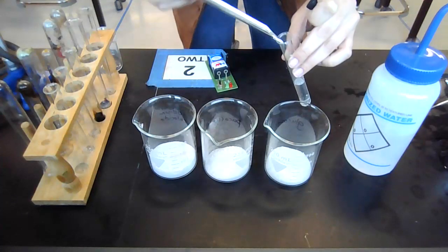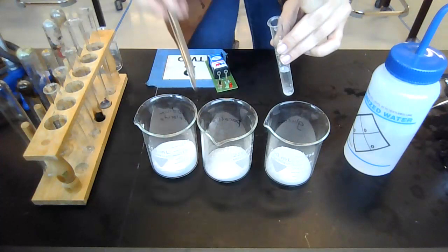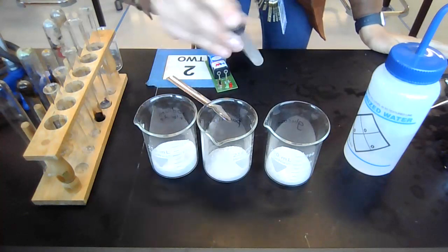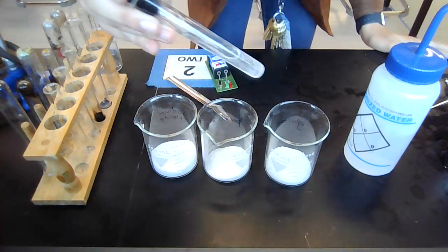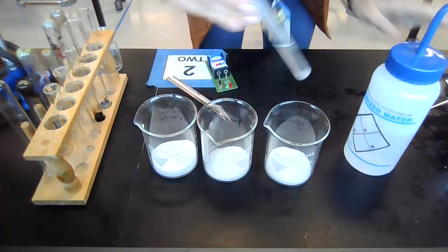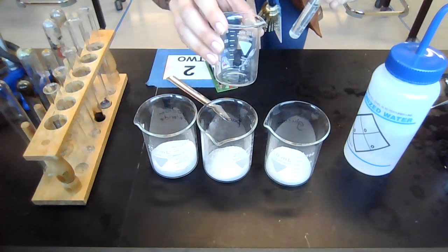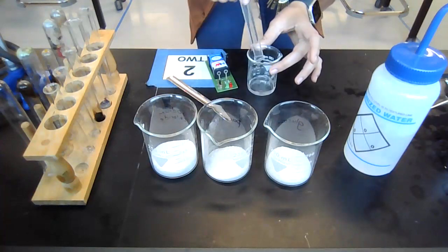So I'm going to add some of my solid into here. Then I'm going to go ahead and shake it. I can see that it is dissolving in the water. That's all dissolved in there. I'm just going to go ahead and run my next test while I'm here. This is currently dissolved in water. I'm just going to put this into a beaker so I have a little more space to do this.